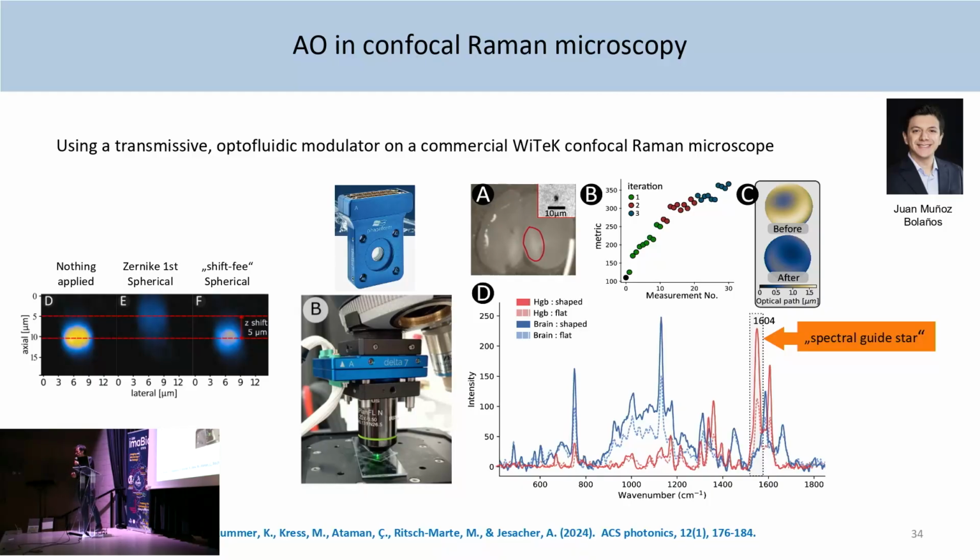So the main motivation for this work, I think, for Raman is not really that you get sharper images. Of course, you also get sharper images, but it's more a saving in time. I mean, there are super fast Raman systems around. Yesterday, I saw one in action. It's actually also here at me4bio. It's worth visiting. Hilton showed me how it works, or his team, actually. But if you don't have a fast Raman system, those scans can take hours, depending on how weak your signal is. If you can then increase your signal by a factor of 2 or maybe even more, you just save 50% in time. And I think if that's a routine operation, it's really something worth following up.